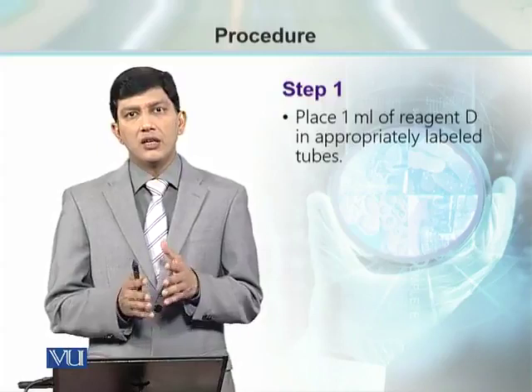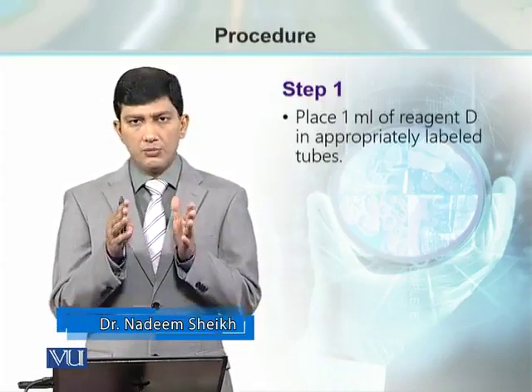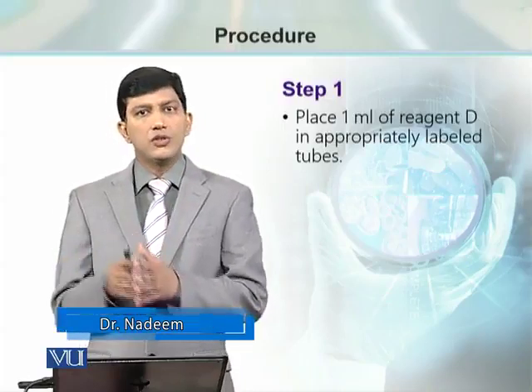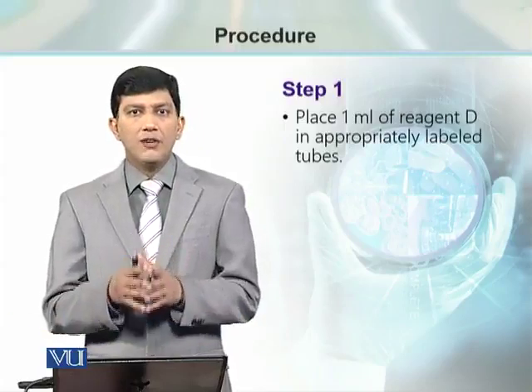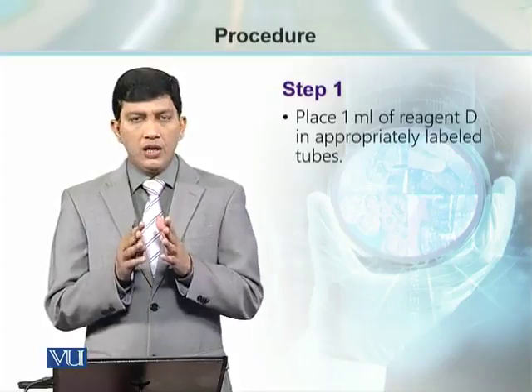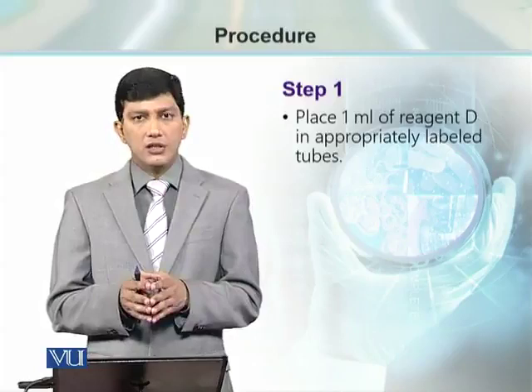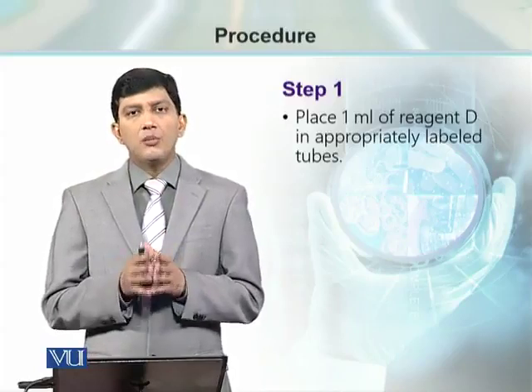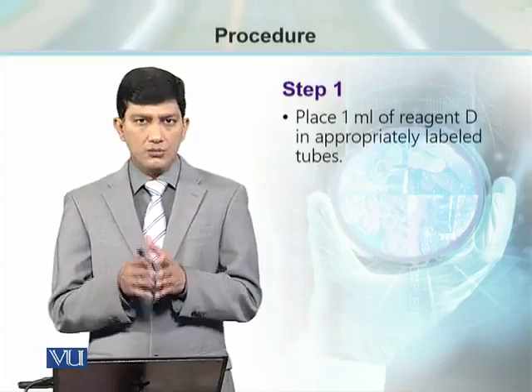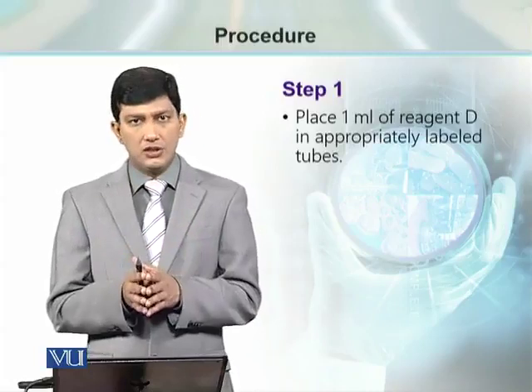अब यहाँ पे हमें डिसाइड करना है कि if we are going to prepare the standard curve for particular assay so that we can determine the concentration of unknown samples, or we already have prepared a standard curve and we will use that one. We are going to talk about preparation of standard curve, जो हमने पहले भी बात की बायोरेट reagent के हवाले से. हमने मटेरियल और मेथड में BSA की डिफरेंट कंसंट्रेशन वाले सॉल्यूशंस यूज़ किए, सॉल्यूशंस की हमने जो है वो प्रिपरेशन की ताकि हम स्टैंडर्ड कर्व प्रिपरेशन की तरफ जा सकें.